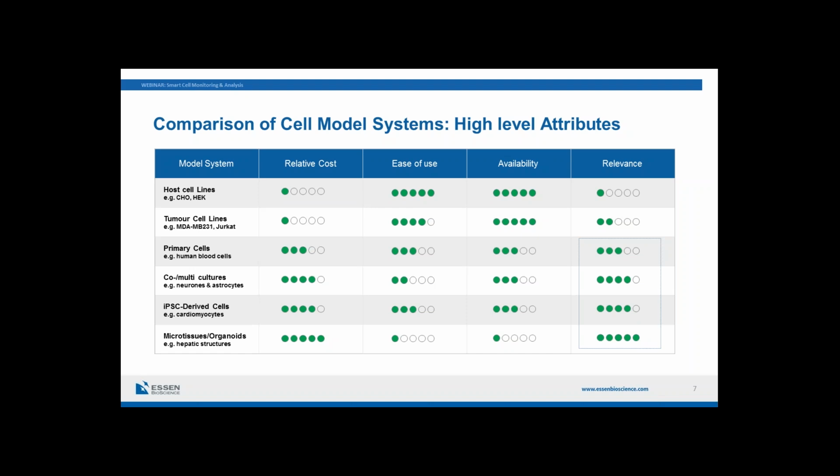So the experiment that we're all part of is this search for greater translational relevance, but the quid pro quo is that these new cell models are more challenging to work with, they're typically more costly, and certain cell types have a limited availability, which forces the need to do what I'm going to refer to as economic experiments.